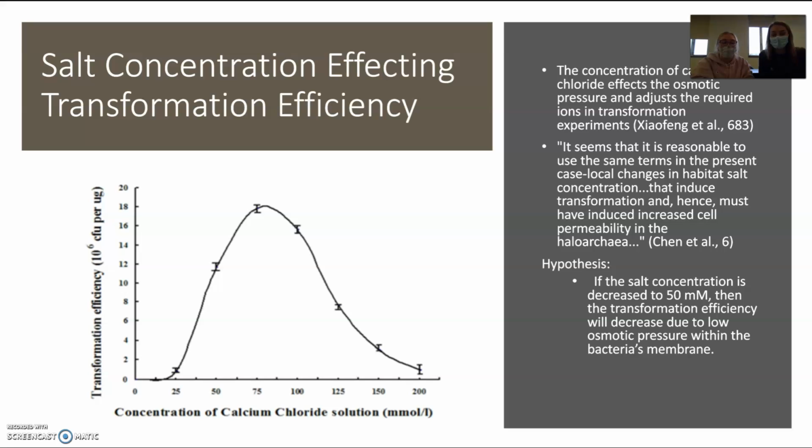And as seen on this graph, the concentration of calcium chloride solution needs to be pretty favorable in order to have transformation efficiency.